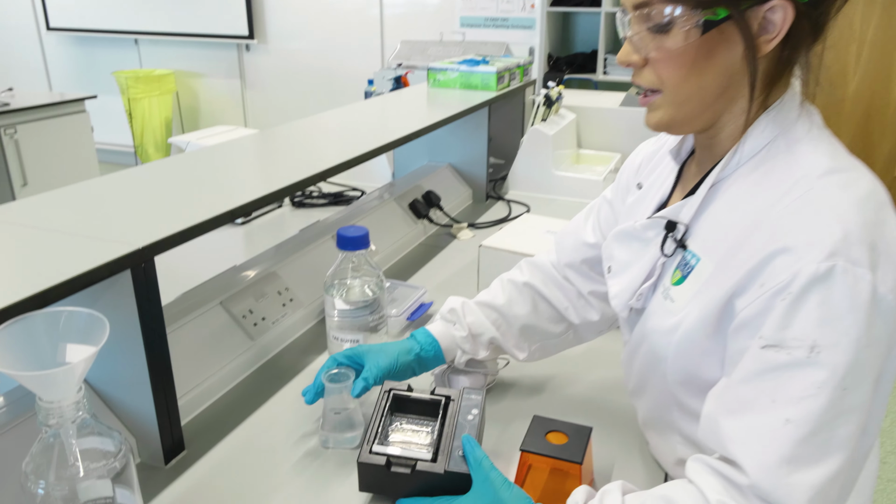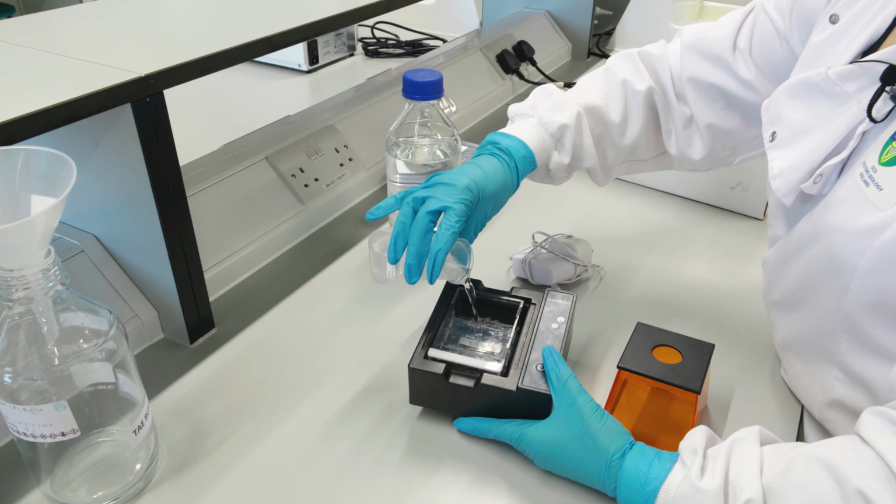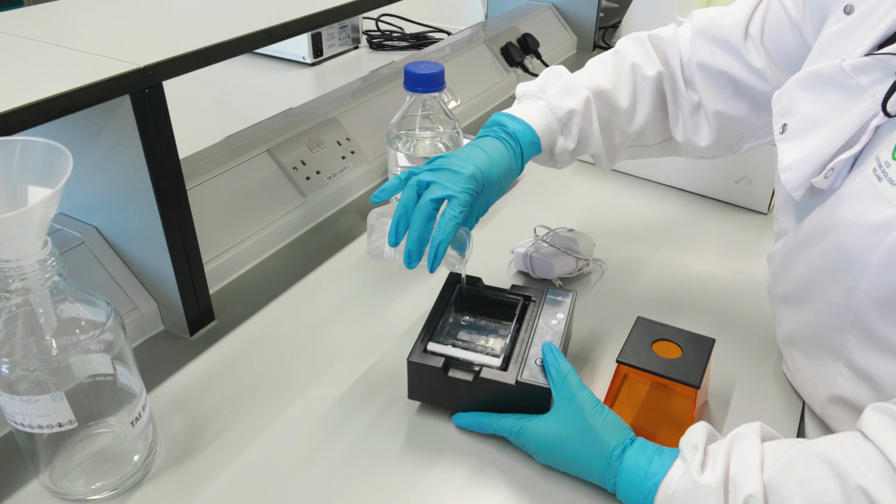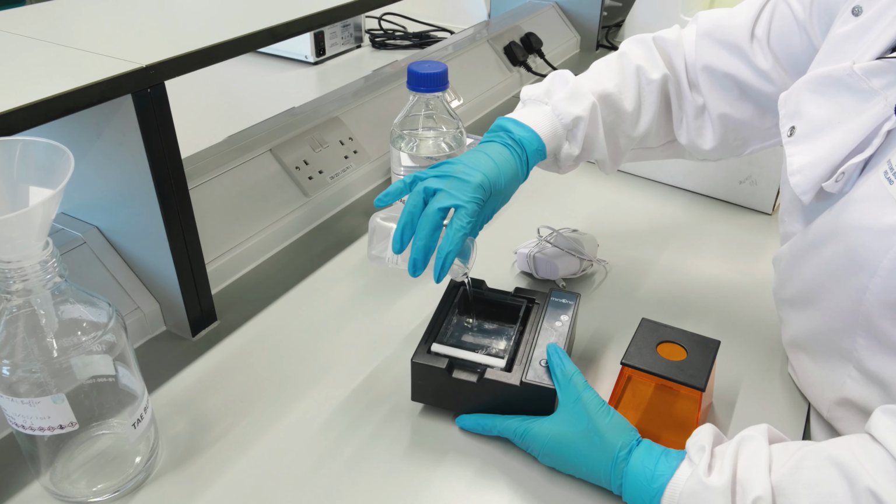So when you're pouring in the buffer, make sure you cover all the wells and make sure there's no air bubbles between the gel and the slide. If there are any air bubbles, you can take the tray out and push it down harder and squeeze all the air bubbles out.